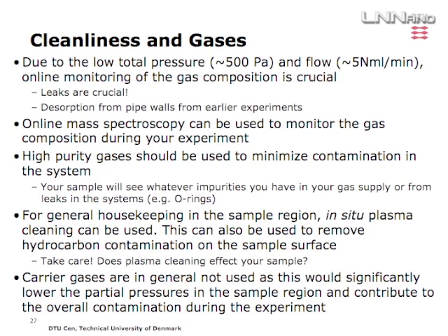You also want to make sure that your gases are compatible with the O-rings, and you should also know that there's a bunch of O-rings on microscopes today, and you do have a leak in there as well. They are not completely tight.